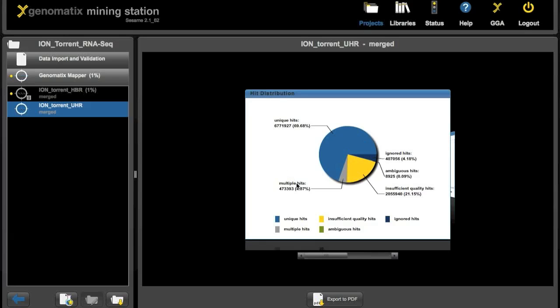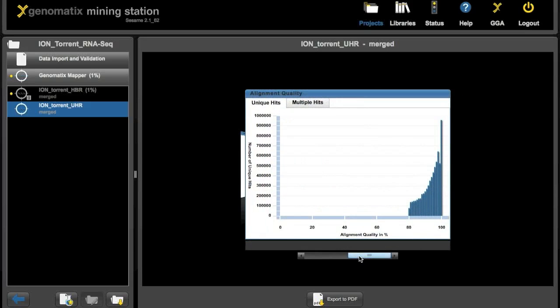The statistics show you how many reads could be mapped uniquely or multiple or insufficient for the analysis. And moving the slider down here we also get a histogram showing us the read qualities. They start at the minimum 80 percent that we set and go up to 100 percent.